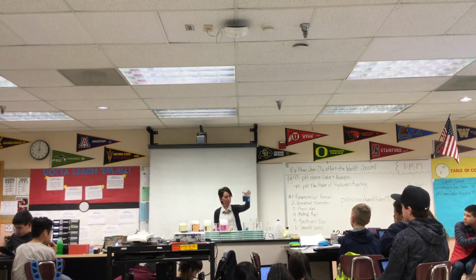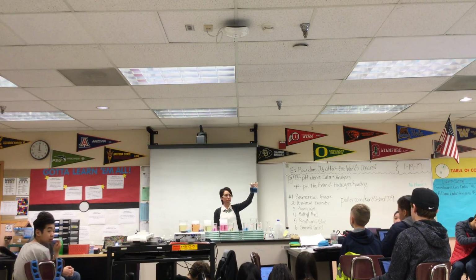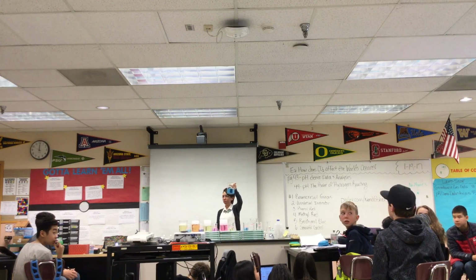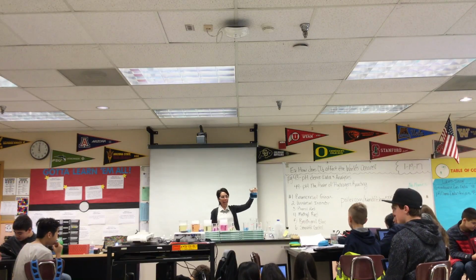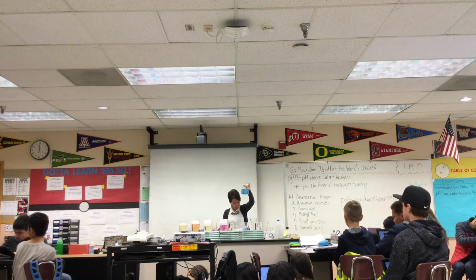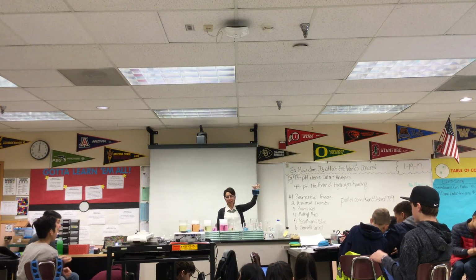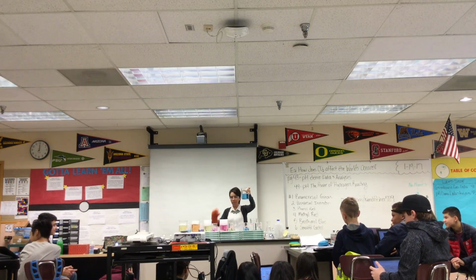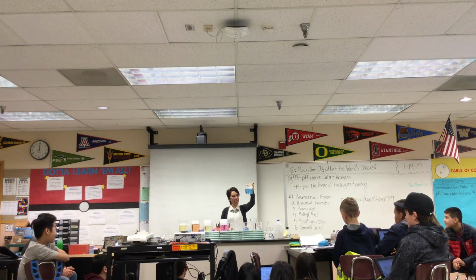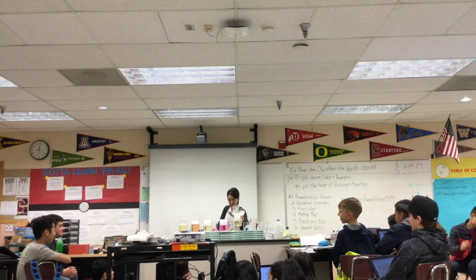How would you describe this shade of blue? Sky blue. It's almost the same color as the bulletin board back there. Bulletin board blue. All right. And if we become more acidic, what color does it turn? Yellow. And this one does go pretty fast, so don't look away this time. Watch it. Yeah. There we go. Pretty fast.